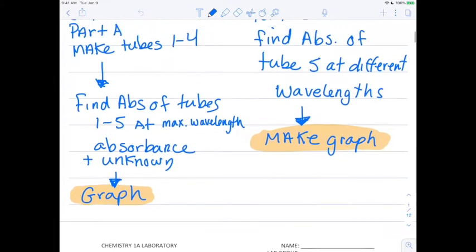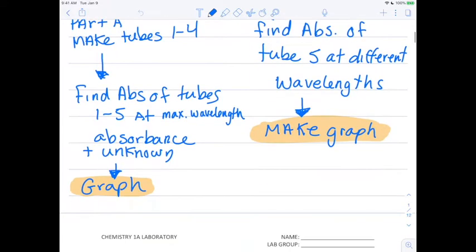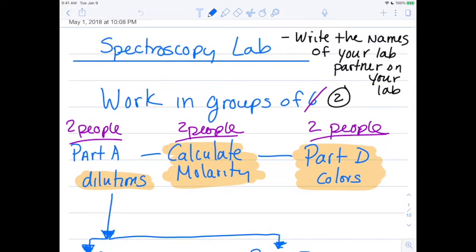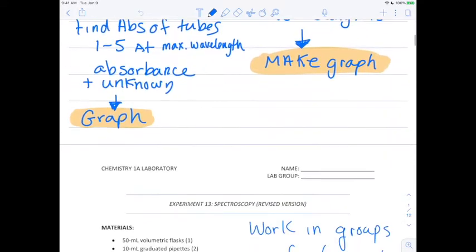And then we're going to have 2 graphs. So this is the whole lab here. It's got a lot of stuff. However, you're only going to be doing the stuff that I have highlighted here. The other stuff would be the lab stuff, which is fun to do, but it's also a hectic lab trying to organize everything with a group of 6. If you talk to people who've done this lab last semester, they probably would say you're very, very lucky to not need to actually go through it. But what I want to do first is take a look at calculating out our dilutions.